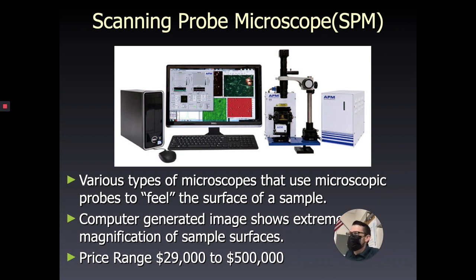These microscopes can range in price from $29,000 to about $500,000. Surprisingly, they're not as complicated to use as some of the electron microscopes. It does take a little bit more training than your typical CLM, but these are very commonly used in different industrial applications.